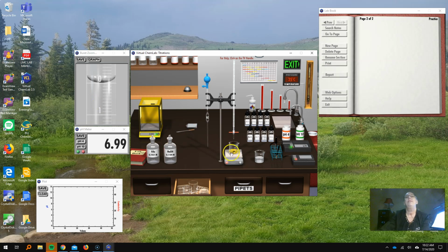Okay, so it's nice we're on video. You can go back and forth and make sure that you know we started at 0 for the titrant and then wherever we end up to get to the green color. Okay, I'm going to let it go all the way to the blue color so you see how the graph will look when we're titrating a weak acid.